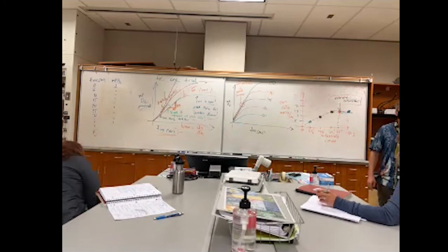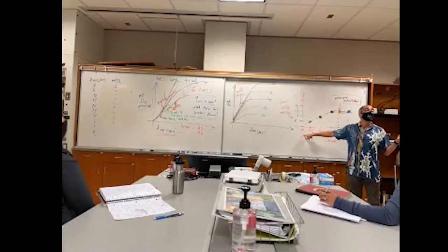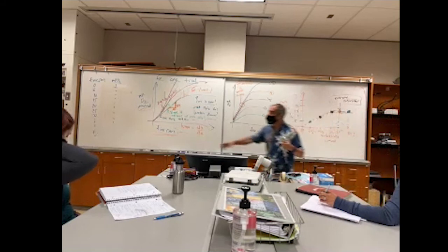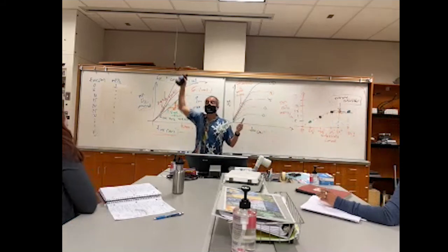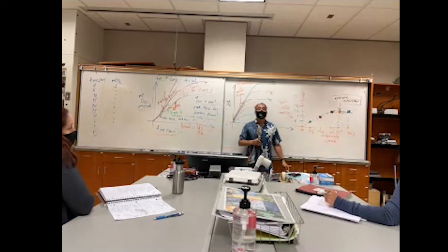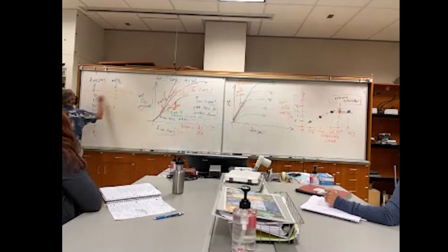So you're going to do this reaction with 0 substrate, just with distilled water. Do it with 100%, pure 3% hydrogen peroxide. And then with all these different dilutions in between. In each case, you're going to make a big table full of numbers and record all your data.